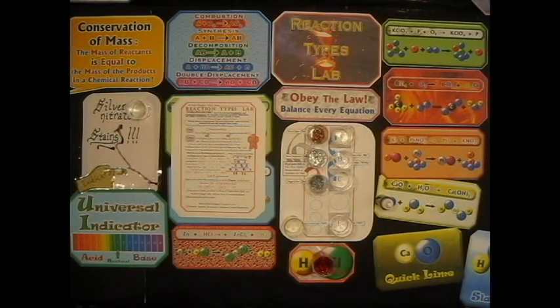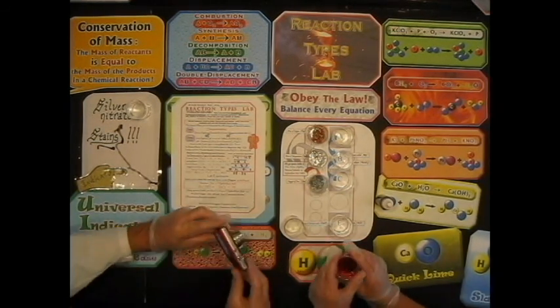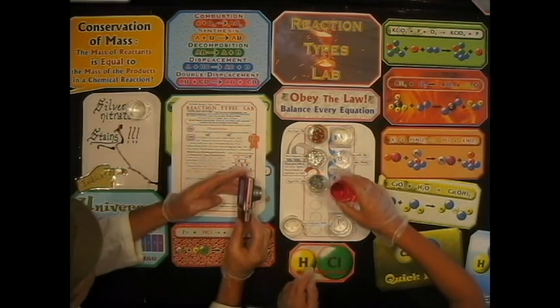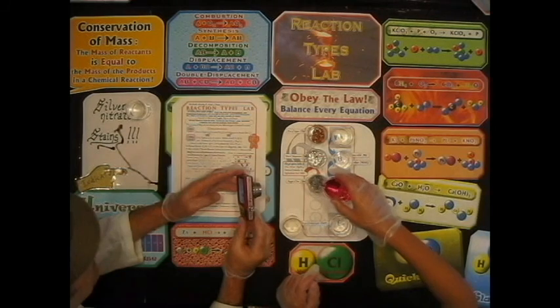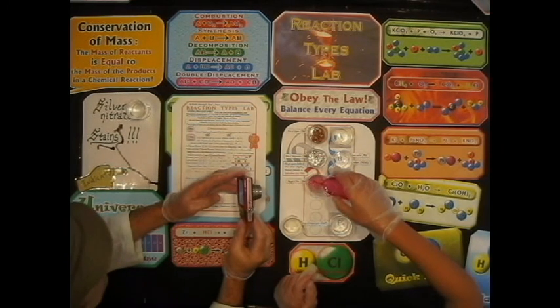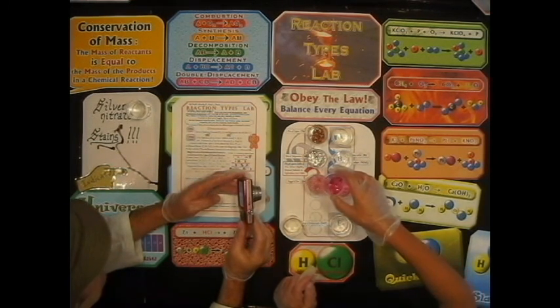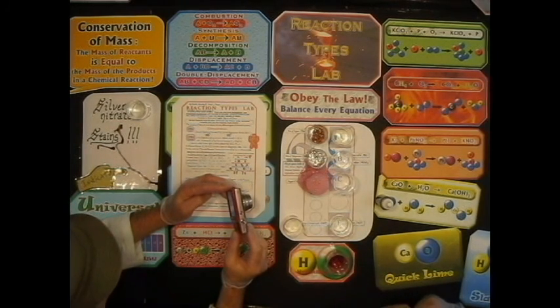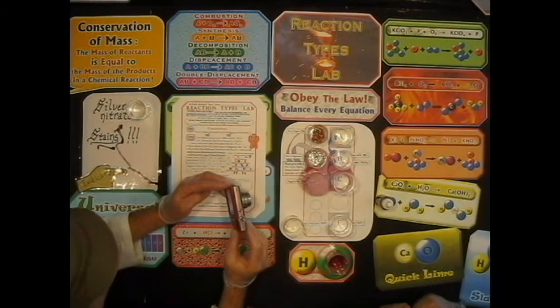So go ahead and pour it in, and I want to get a good shot of the reaction. And once it gets going, Giovanna's going to get the temperature of the zinc. Just pour most of it in, doing a big scale reaction. Okay, that's good. That's enough. That's a good reaction. So I knew this might foam over. I had a suspicion. But that's a good reaction. Oh, wow. There we go. Get the temperature, Giovanna.